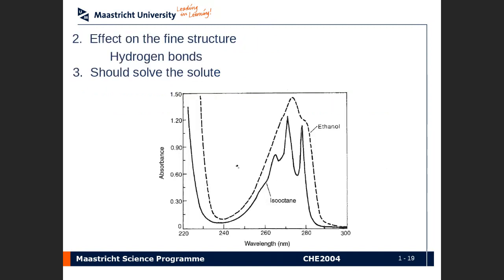And just to show you how the solvent can affect the UV-Vis spectrum, I have an example here of how it can change the so-called fine structure of a UV-Vis spectrum. In other words, looking at the resolution, if you will, in different solvents.